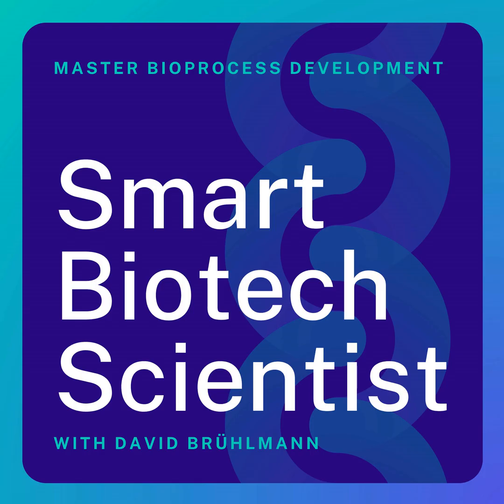Unfortunately, there is not a single way to do this. You have to deal with the heterogeneities that are there in industrial scale, in the lab scale, because typically it's well mixed. That's difficult. I like that. So the advice I'm hearing, Lars, is that you do these mixing studies and mass transfer studies very early on, in as small a bioreactor as possible, so that you will not lose any time and you will be able to foresee bigger issues, right? Yeah, that's correct. It can really help you improve your process.